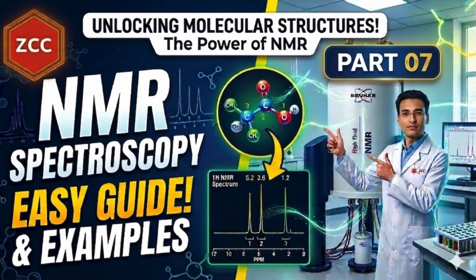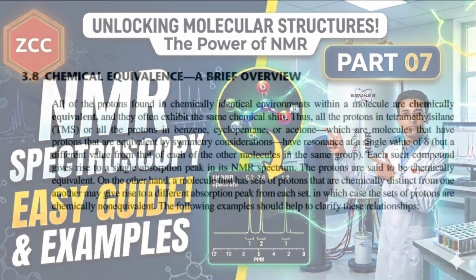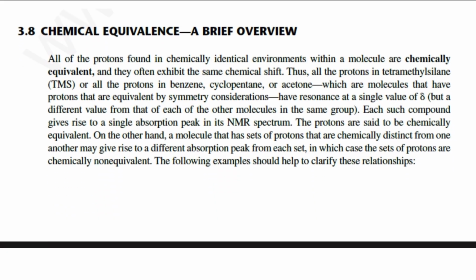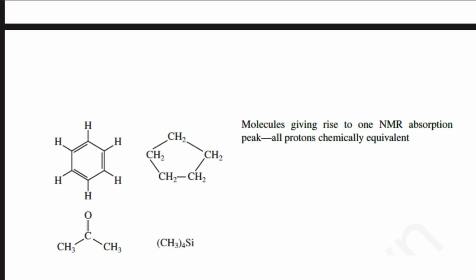So today is part 7 of a lecture series about NMR spectroscopy along with its easy guide and examples. And in this particular lecture, we will discuss chemical equivalence and how to integrate NMR peaks. So today we will start our lecture with the topic of chemical equivalence and its brief overview.